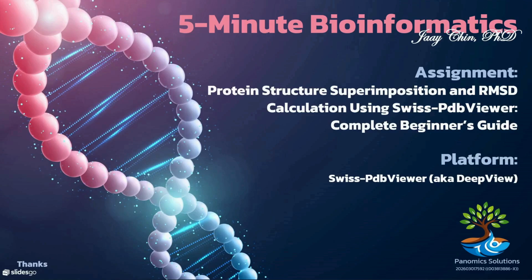In today's episode, we'll learn how to perform protein structure superimposition and calculate the RMSD, root mean square deviation, between two structurally similar proteins using Swiss-PdbViewer, also known as DeepView. Let's dive in and get started.